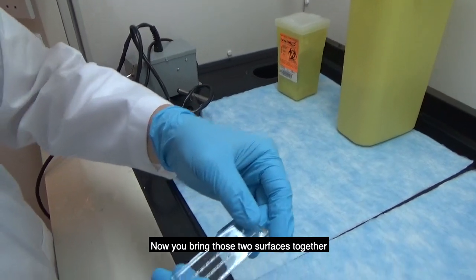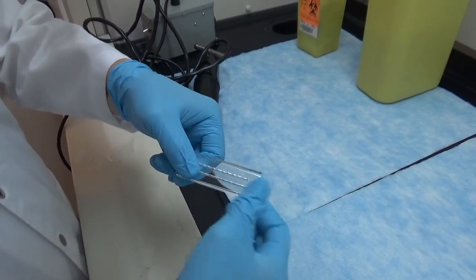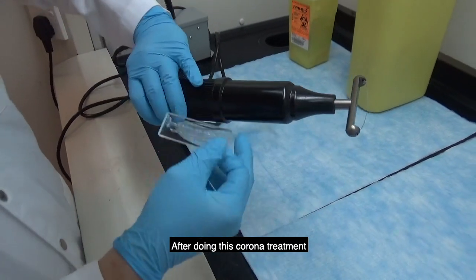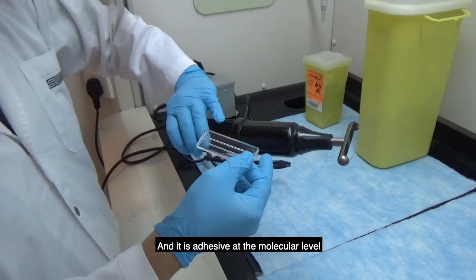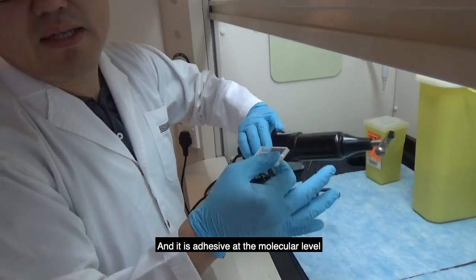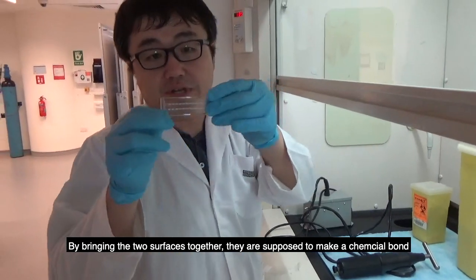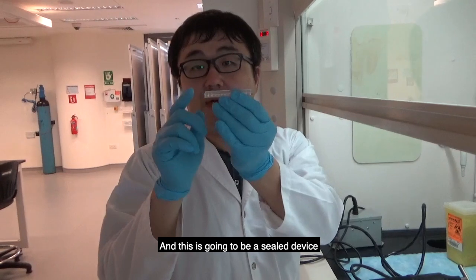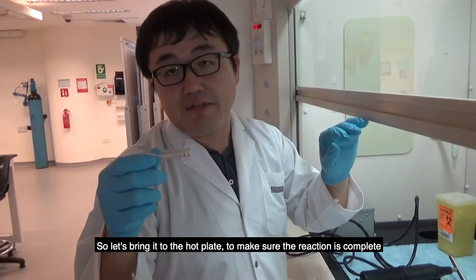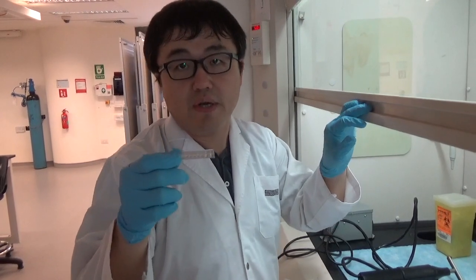Bring the two surfaces together. After the corona treatment, the surfaces are oxidized and adhesive at the molecular level. By bringing the two surfaces together, they form a chemical bond, creating a sealed device. Let's take it to the hot plate to make sure the reaction is complete.